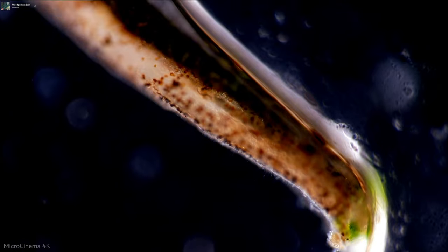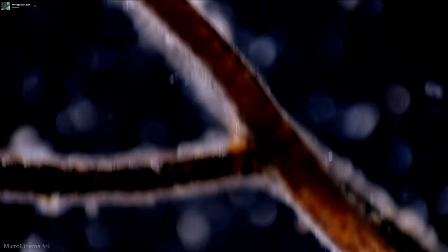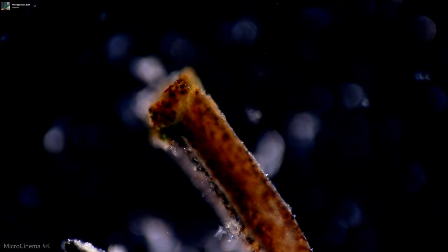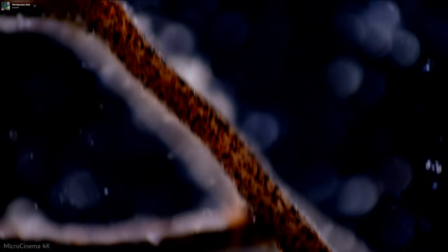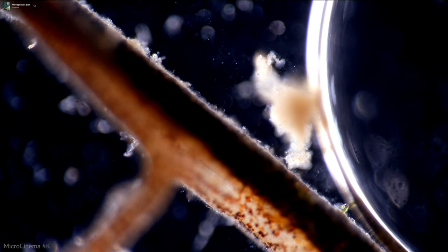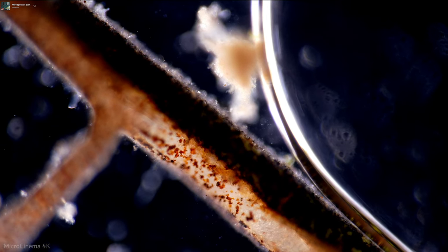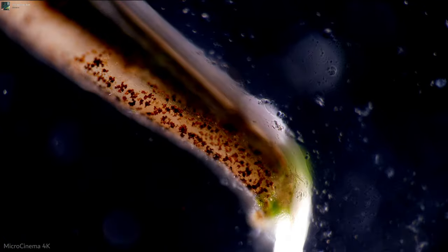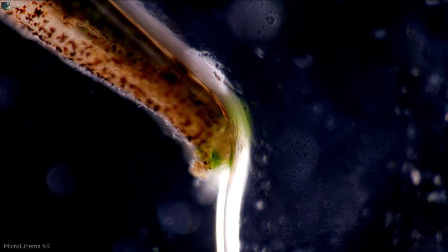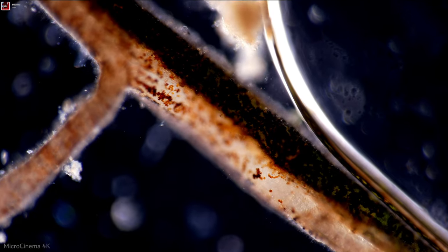Actually, I wonder, yeah, okay, I thought maybe I was seeing that. So look at this. You see there's actually two little tubes. There's one that's catching the light here and lighting up, and there's a darker one. So one thing I thought was, okay, maybe the darker one is some kind of algae, seaweed, or something like that, and then this lighter thing is an organism that grows on it. Right there where it's chopped, you can see there's some green, so that would kind of support that idea.